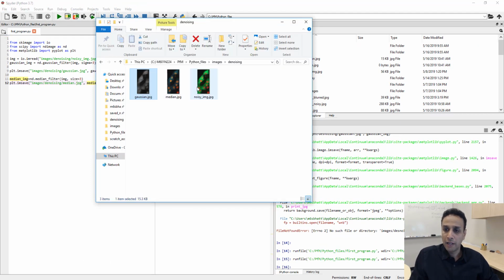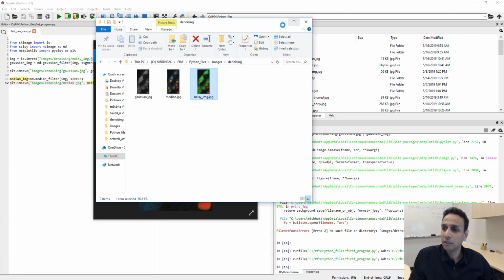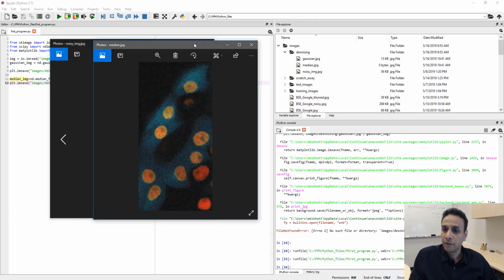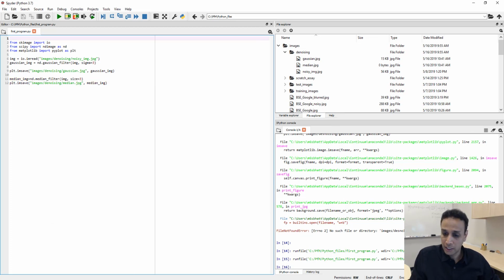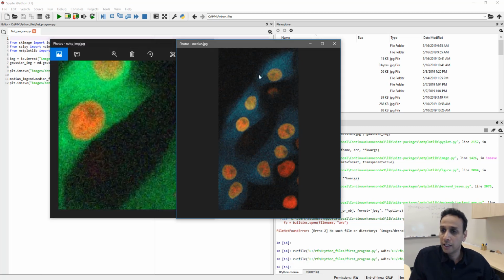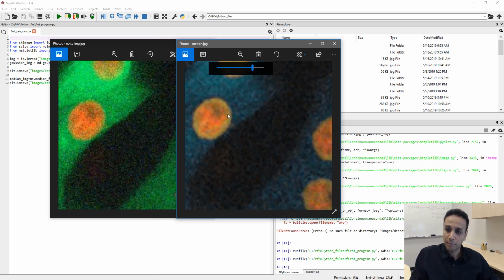and there you go. I have a median image, and let's go ahead and open it and compare it with our original image. Again, let's minimize this. Okay, so as you can see, now this is much better than Gaussian already. When I zoom in, you should be able to see, sorry about that. Now I have many of these, so okay, there you go. And now let's zoom into this image, and you can actually see that the edges are perfectly preserved. Yeah, and the image is denoised. I mean, I still see something going on here.